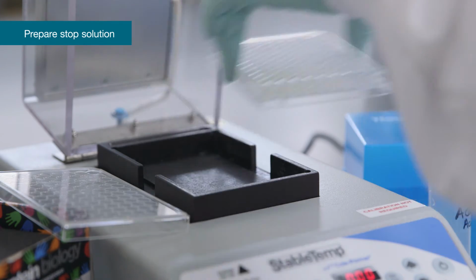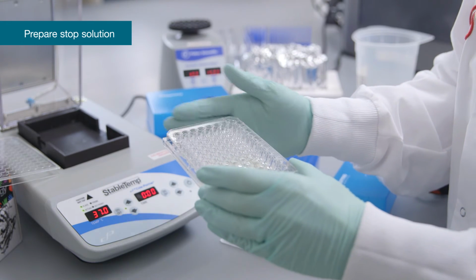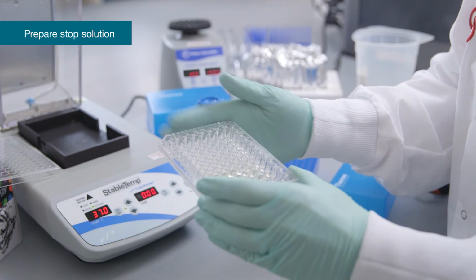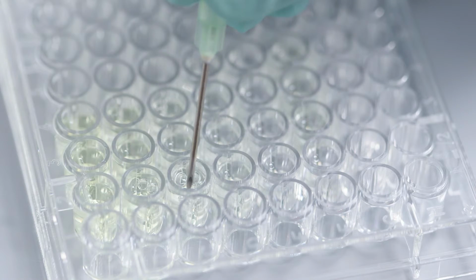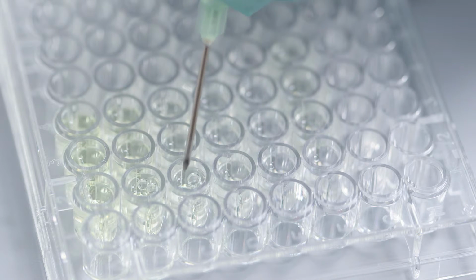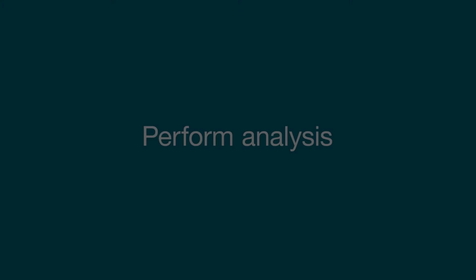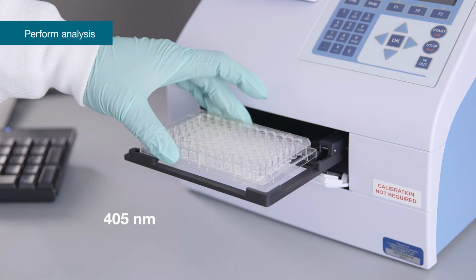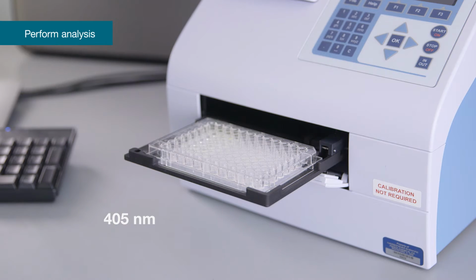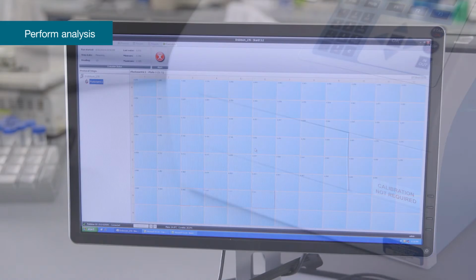Remove the plate from the heater and gently tap 10 times on the side of the plate to mix. Watch for bubbles, as they will affect the optical reading. Use a micropipette tip or a needle to eliminate the bubbles. Read the optical density at 405 nanometers immediately after assay completion. If the plate is read at a later time, keep it covered to avoid evaporation.